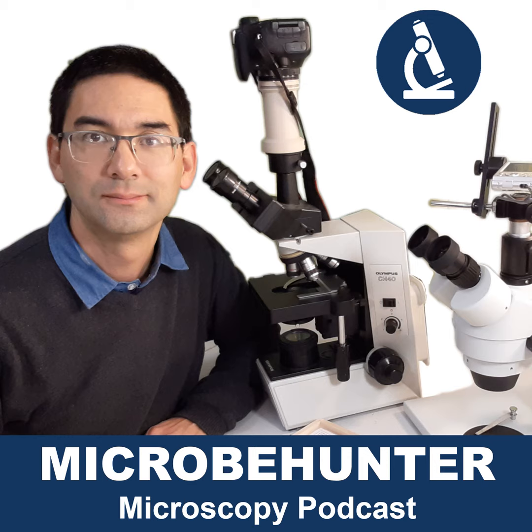Let's say that you're interested in both, and you do not want to spend money for both. Well, then I'd advise you, as I already mentioned, to buy yourself a compound microscope, simply also because they are more difficult to use, and at the beginning at least there are more things that you have to do, okay, in order to get a sharp picture.